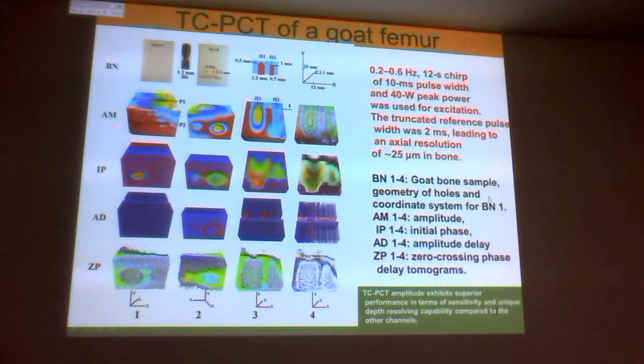And in this one, I look at the amplitude and the phase. And then we can slice this over P1, a plane down that way, or a plane horizontally that way. Out of all those planes, I see the two holes. So here is the hole that was generated, radiating from the top. I see the hole generated by this drill. This is the fat drill, and this is the narrow drill right here. This is the back field. You remember there's a thermal field here. There's an interface, so heat tends to sit there, which means this is showing up as a heat accumulation. But this is the body of the drilled hole. This one shows the body of the fat drill.